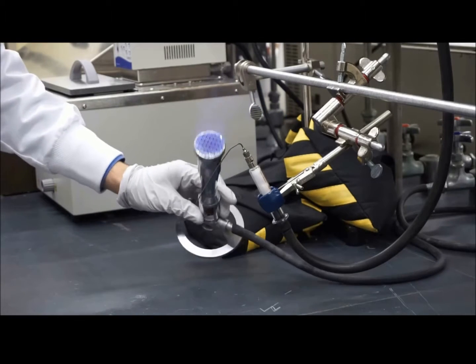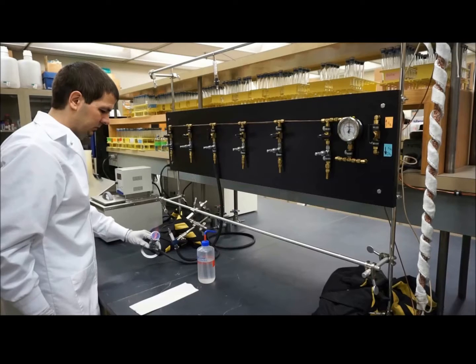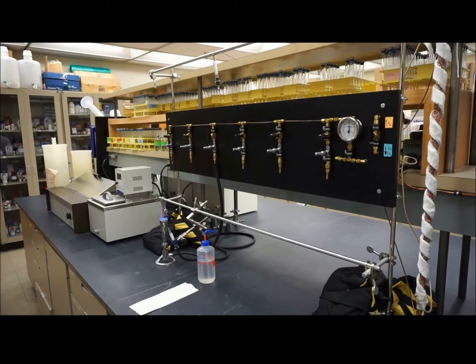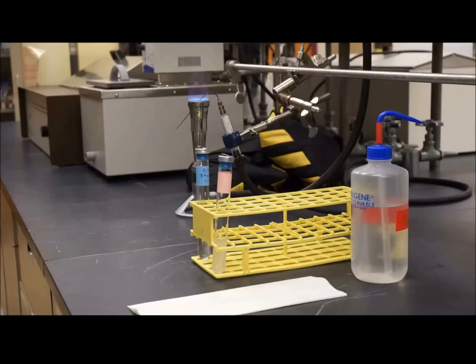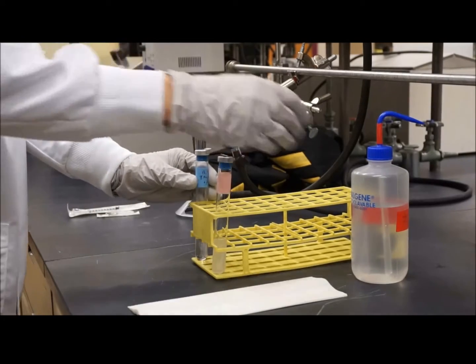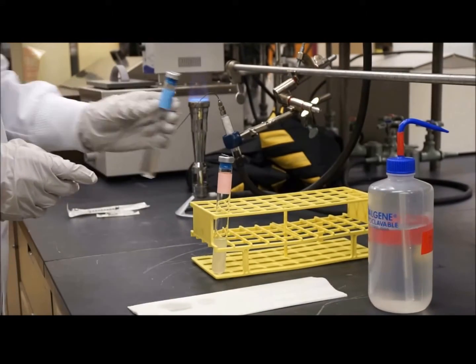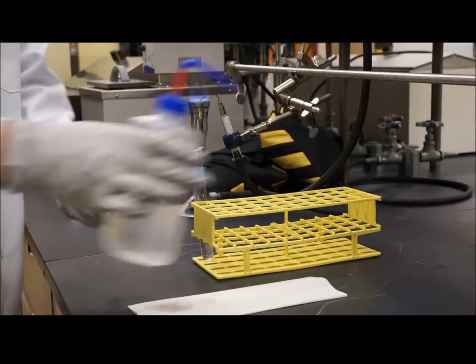We flame the needle of the probe with a Bunsen burner. It should still be sterile from autoclaving, but we flame it as a precautionary measure because it's easily contaminated. We retrieve 2 tubes, one containing the old culture and one containing fresh media. We retrieve a 1 milliliter syringe and needle, which we will use later to transfer the culture. We sterilize the rubber stoppers of the tube by spraying them with 70% ethanol and igniting the ethanol with a Bunsen burner. We do this for both tubes.